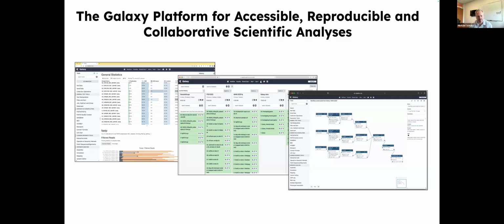One really special part of it is for most users, you're going to access it entirely through your web browser, be it Chrome or Firefox or whatnot, without any sort of programming experience, and you can do really, really sophisticated analysis. You can run state-of-the-art genome assemblers, aligners. You can look for genes. You can look for proteins. You can look at evolution. You can do machine learning. You can look at all these environmental factors, chemistry, proteomics, and beyond. There's just a lot of really sophisticated capability that's all embedded inside of your web browser.